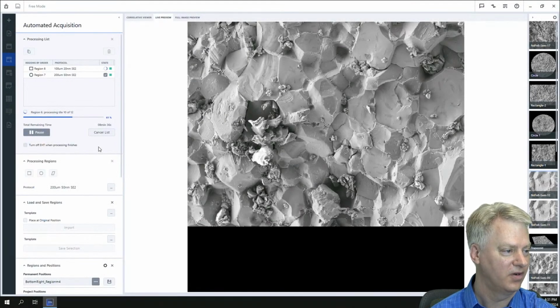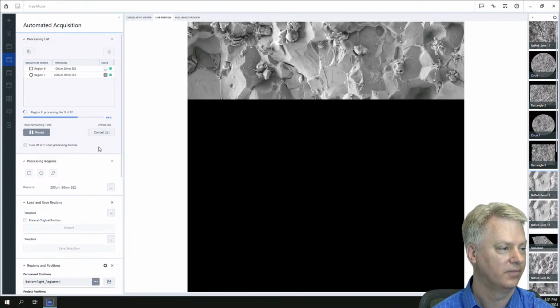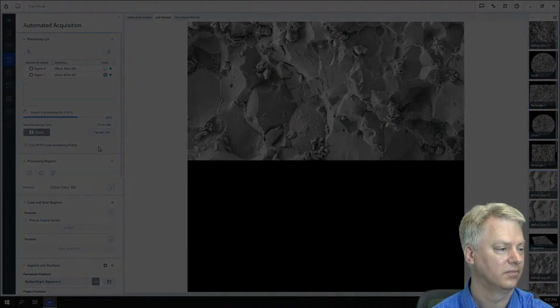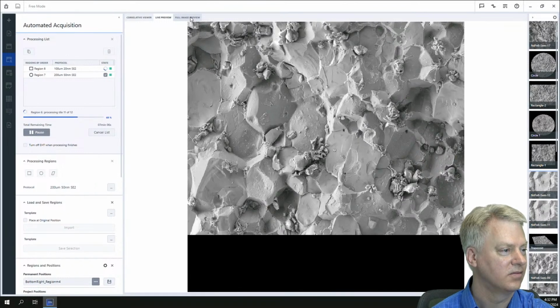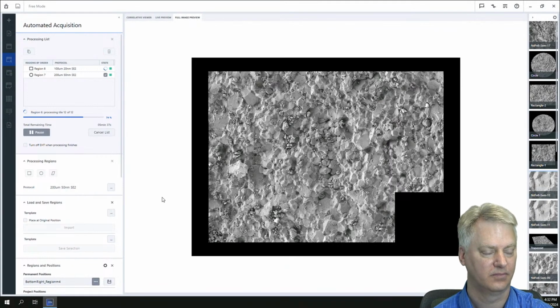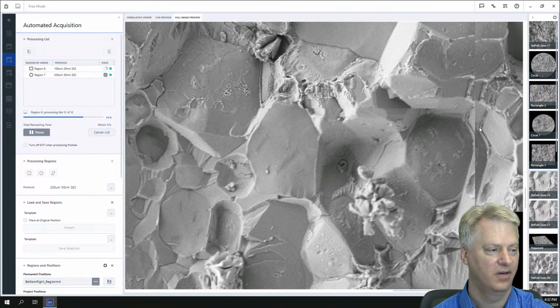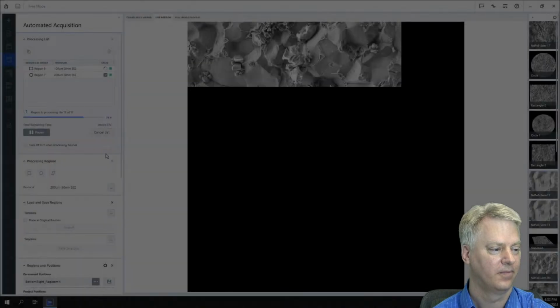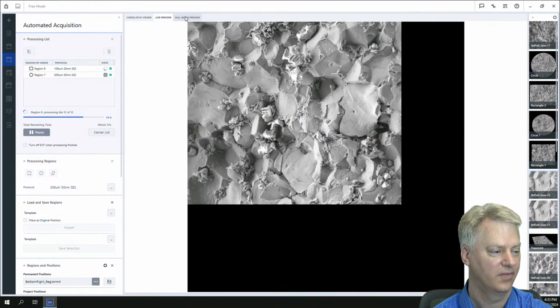If we are finishing up on this, it's about 2/3 of the way through here. All right, so let's see it dump in, it's going a little bit slower right now. I'm just taking it as we go in the last couple of tiles. It's completed 10 out of the 12 tiles. 2 more to go here at this point. Like I said, you can zoom in, you can take a look at the tiles, even though it's still actively acquiring the tiles. This will be the last of the tiles, and then it'll move on to the next region after this.